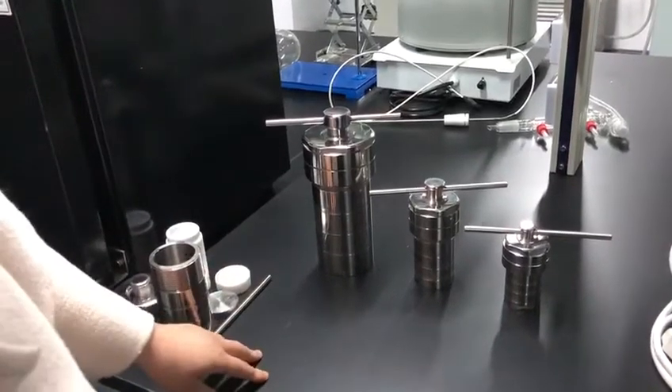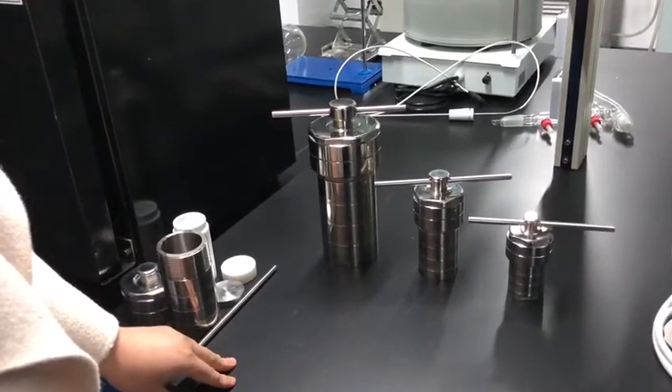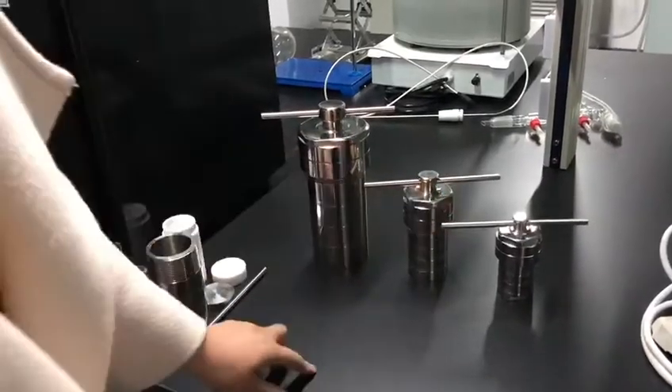Hello, our company is ZZKB Zhengzhou Kedah. One of our favorite products is called the hydrothermal synthesis reactor.